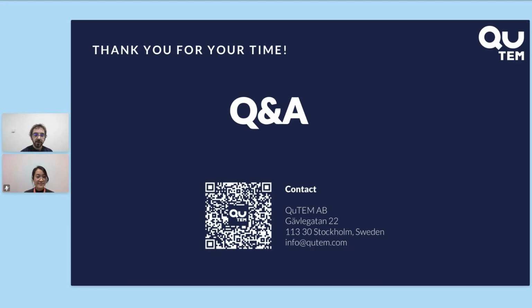So the way it's done is prior to agreeing on the project, we ask for some information about the specimen so that we can run a risk assessment. And once the risk assessment has been run, then we can, of course, agree on the project itself and then receive the samples, so all the way from BSL-0 to BSL-2.